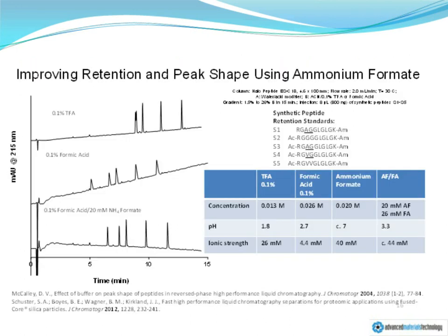Our first foray into this really concerned trying to explore the idea that modifying ionic strength of mobile phase modifiers may have utility.